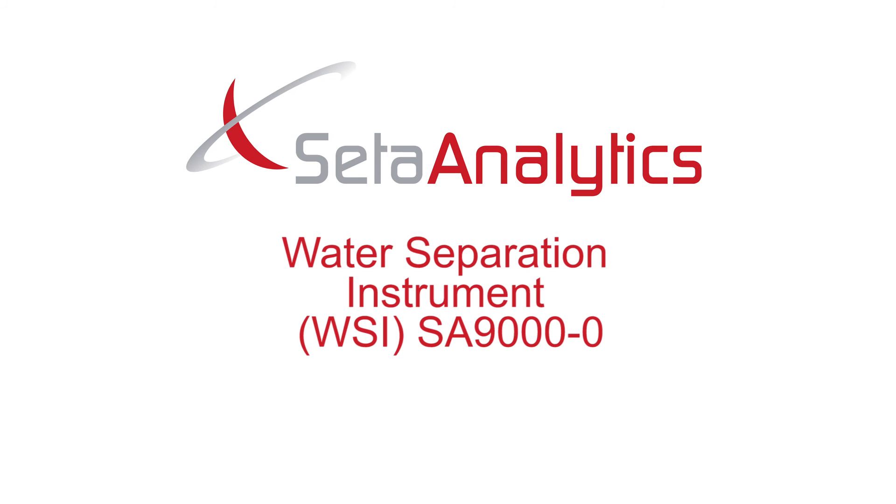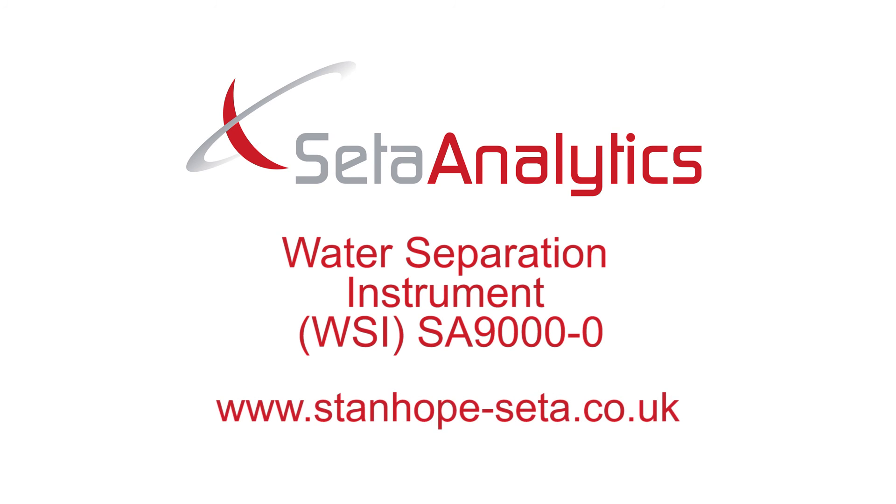You are now ready to use your WSI. For more information please visit www.stanhope-ceta.co.uk.